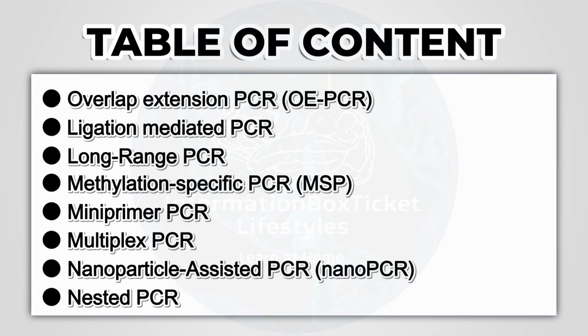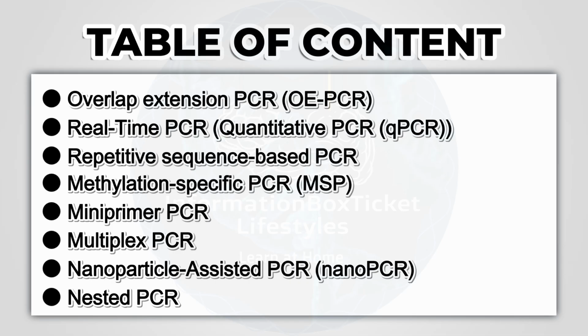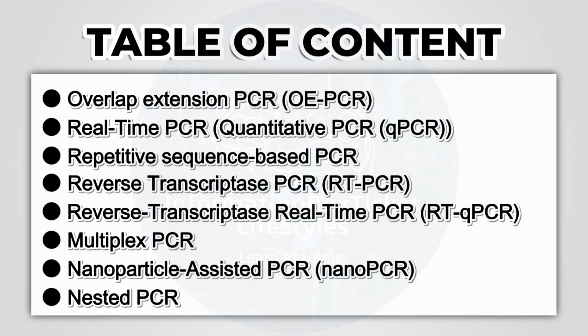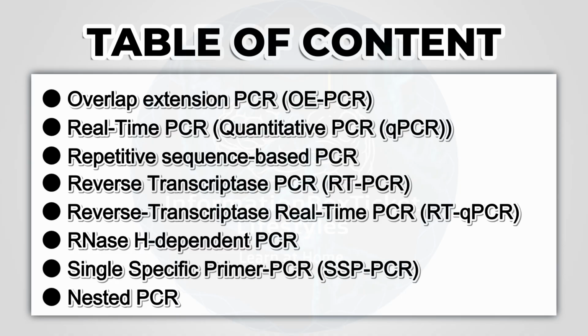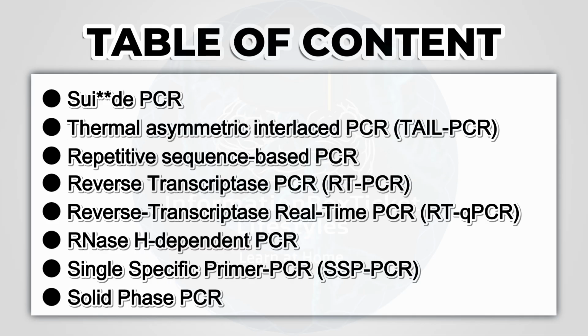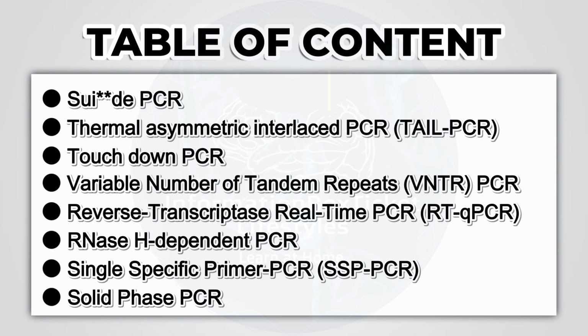Overlap extension PCR, Real-time PCR, Quantitative PCR, Repetitive sequence-based PCR, Reverse transcriptase PCR, Reverse transcriptase Real-time PCR, RNase H-dependent PCR, Single-specific primer PCR, Solid phase PCR, Suicide PCR, Thermal asymmetric interlaced PCR, Touchdown PCR, Variable number of tandem repeats PCR.